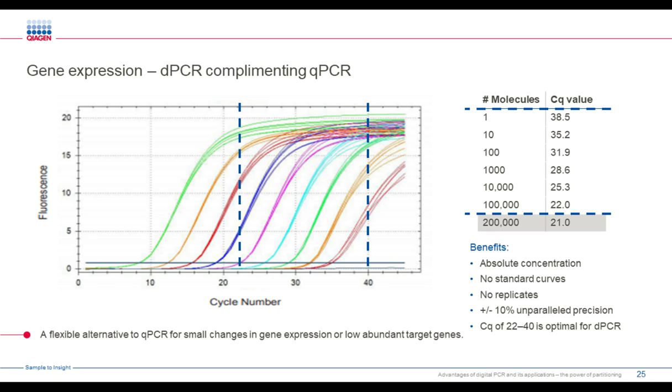If we look at gene expression, and this is where I was referring to a little bit before, if you use your old references, there have been some issues coming forward when you do this, because you tend to oversaturate the system with your old reference genes.